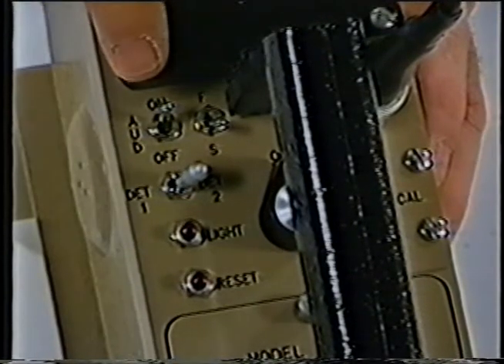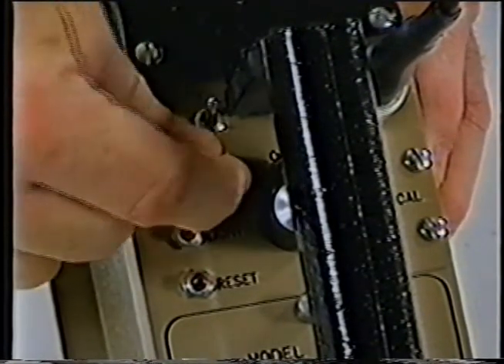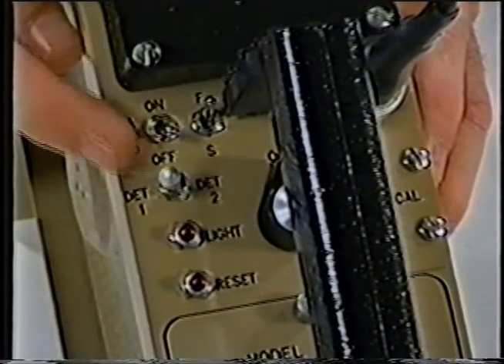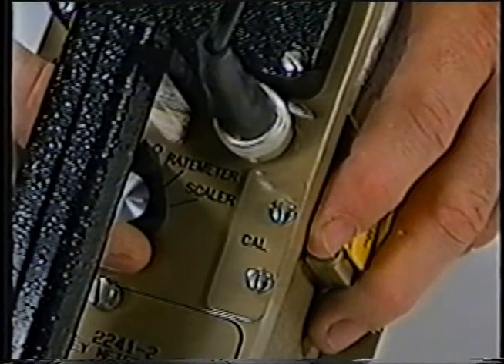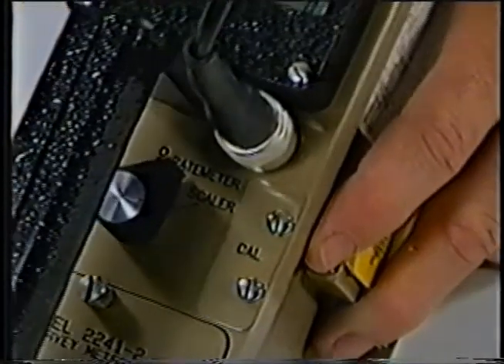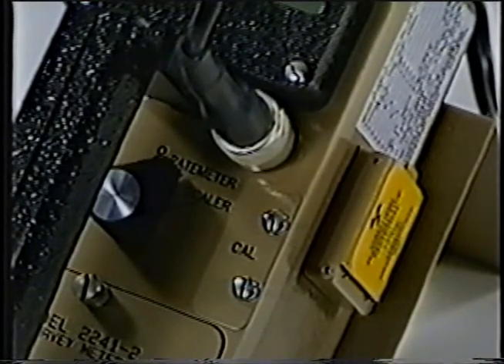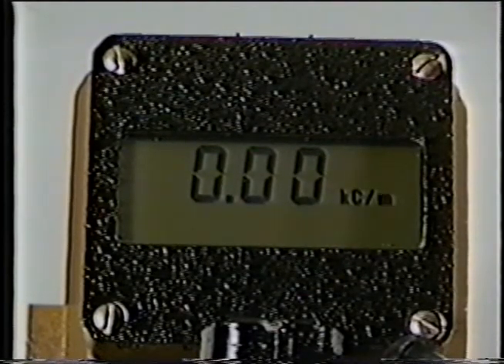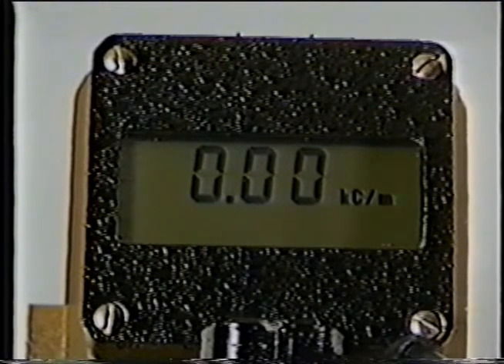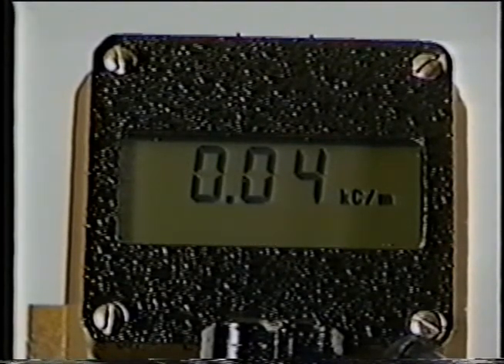Ensure the audio switch is in the off position and the fast-slow switch is in the fast position. Toggle the detector select switch to the detector 1 position — in this demonstration, detector 1 has been programmed to display counts per minute and was calibrated for use with the Model 44-9 detector. Turn the off-rate meter scaler switch to the rate meter position. In rate meter mode, the rate at which radioactive events are being accumulated by the detector will be displayed; this mode is used for general surveying. At startup, the instrument goes through an initialization sequence that lights up all characters on the display, then shows the firmware number and version. After initialization, the instrument will automatically adjust to the appropriate range for displaying the current background radiation count level. Allow the instrument to accumulate counts for at least 10 seconds before beginning a survey.